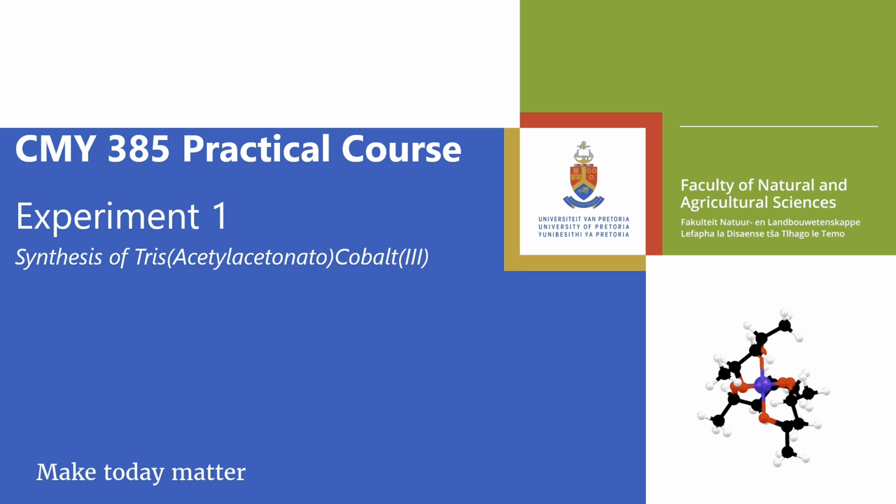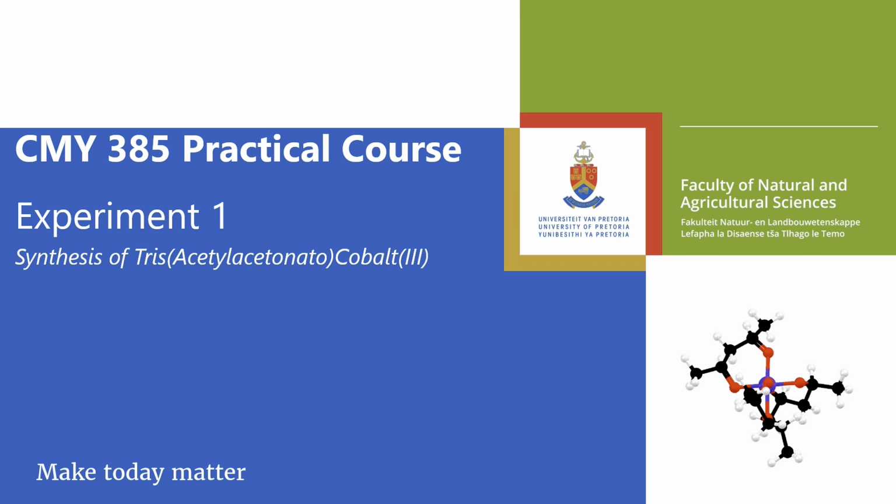Welcome to the experimental video for the synthesis of acetylacetonato cobalt 3.